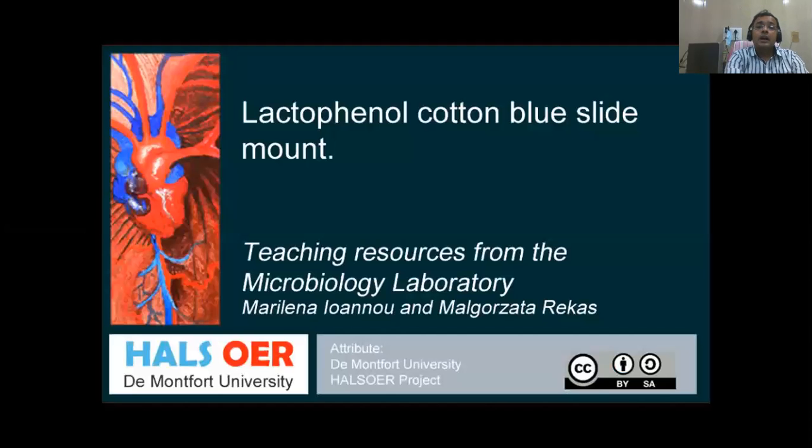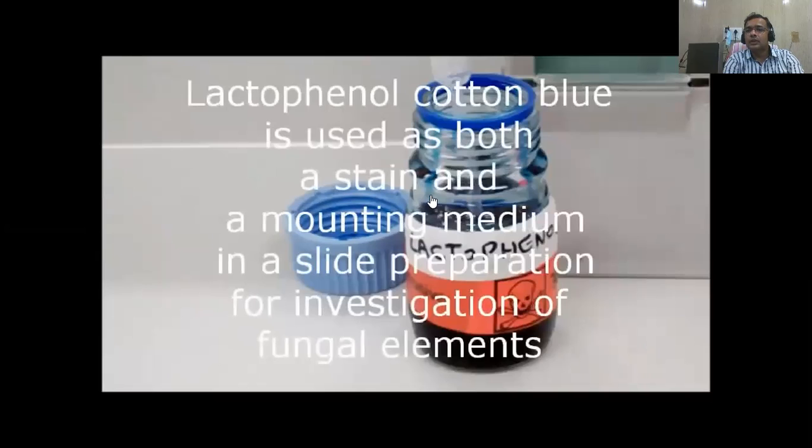Now I have tried to put in a video where you can see how we can perform this particular procedure. It is self-explanatory. It has some captions that you can read, and in between I am also helping you to make it easy to understand. The first is that the identification of fungi mostly relies on structure, and that requires lactophenol cotton blue.